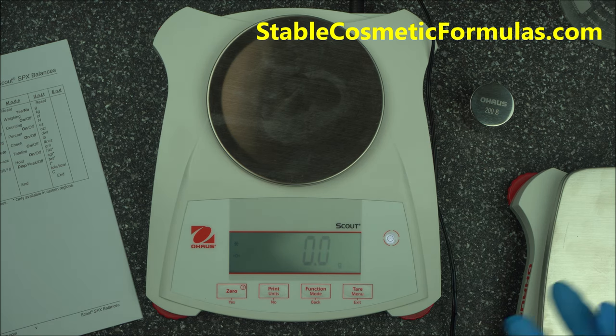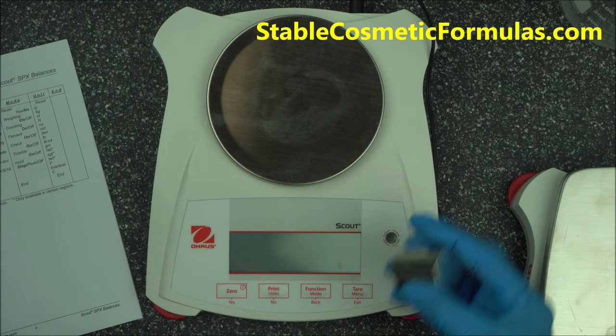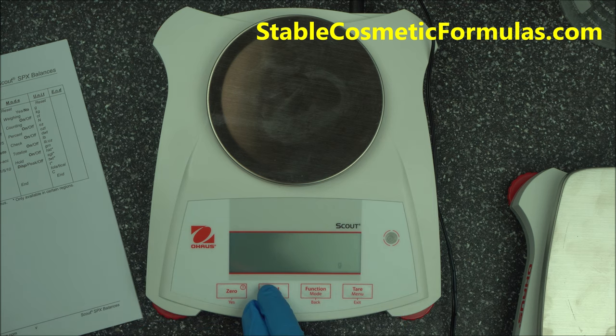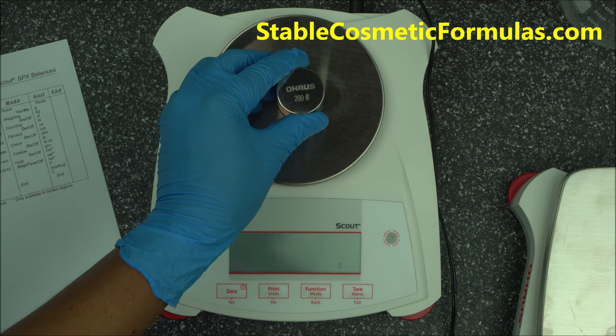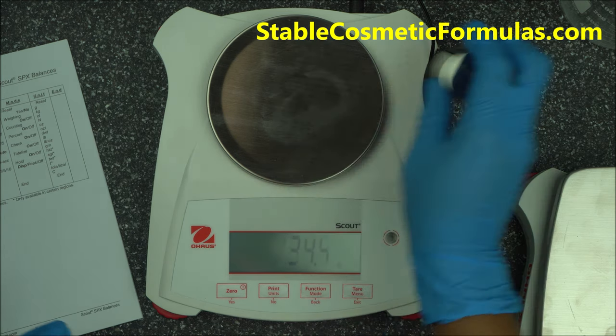Quick recap of calibration: press the menu button until you see 'CAL', press YES. 'SPAN' will show — press YES to begin. The scale will display the calibration weight needed. If you don't have it, press NO to cycle to another weight. Once you have the 200 gram weight showing, place it on the scale, wait for it to finish, remove it, and shut it down — you're done.